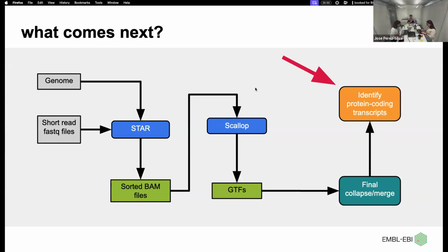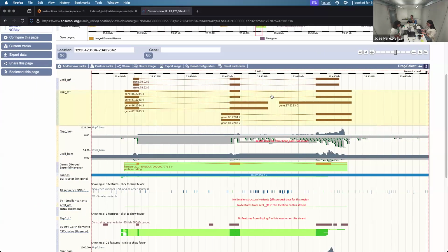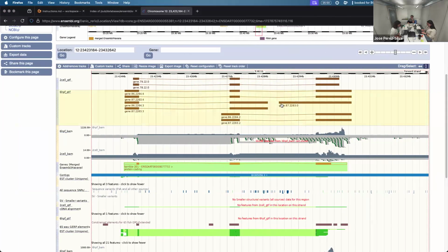And finally, I mentioned at the beginning that this is not the end at all. It is the end of the exercise, but when we are annotating properly, once you have created all of these models and you have filtered through those, for instance, getting rid of this likely incorrect scallop presumption, no?